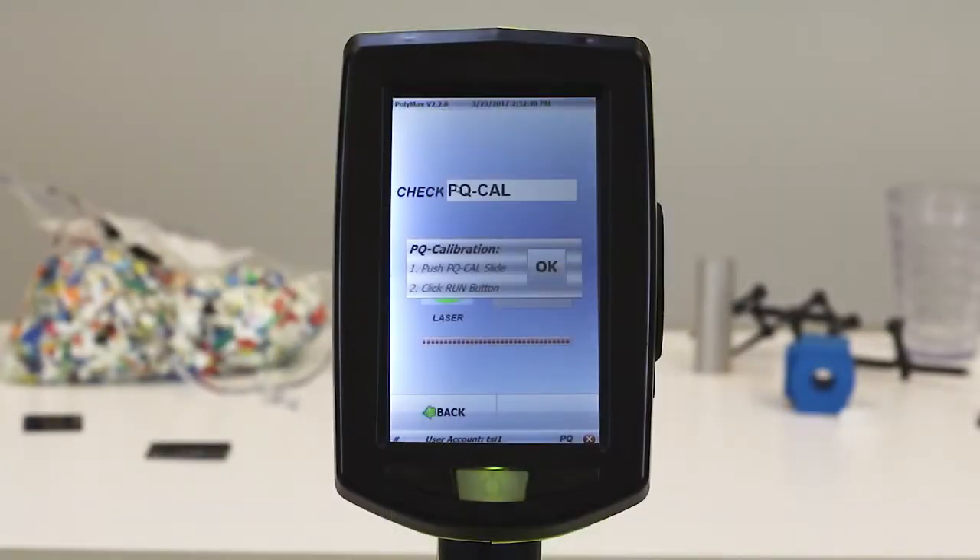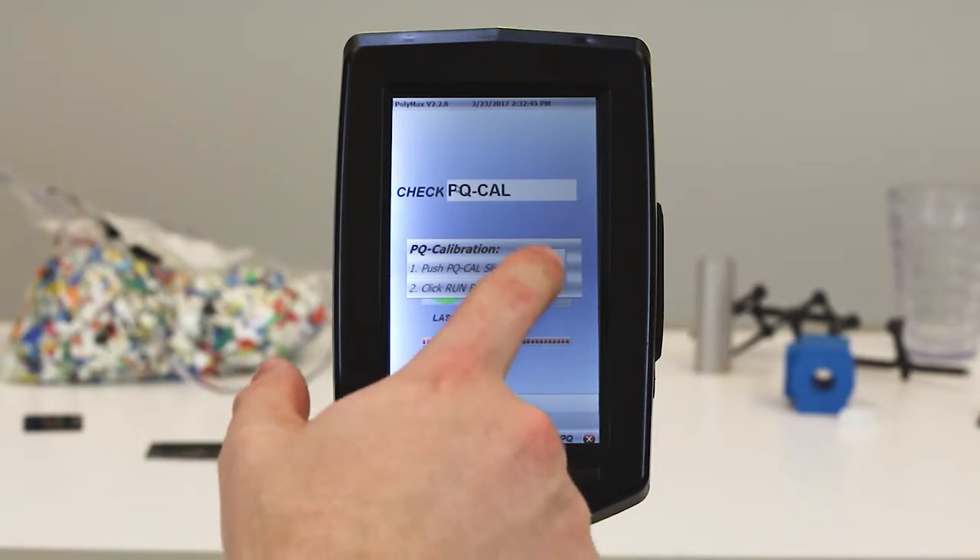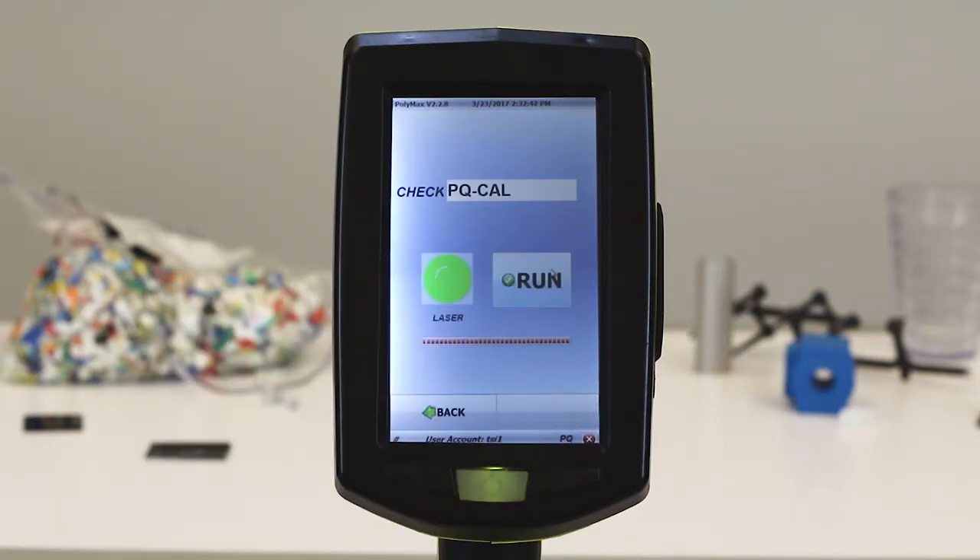On-screen instructions will appear, reminding you to slide the calibration toggle. Press OK, then press Run. The instrument will begin the PQ-Cal process.